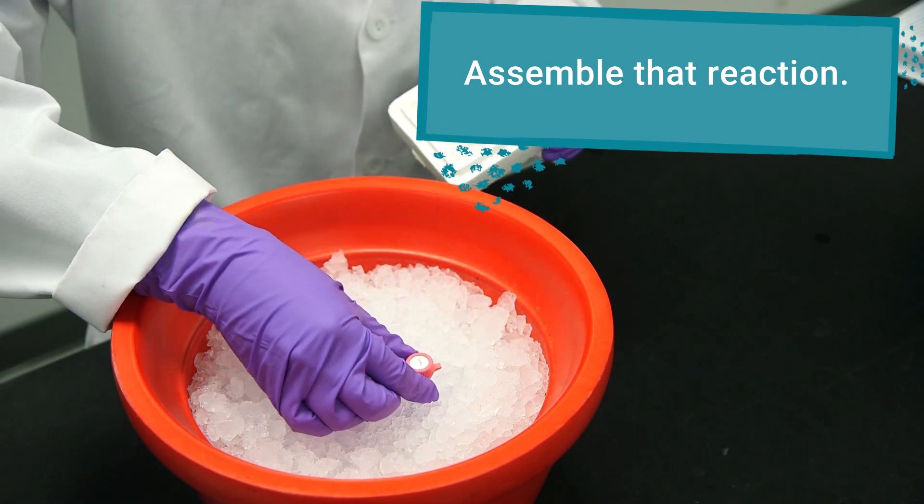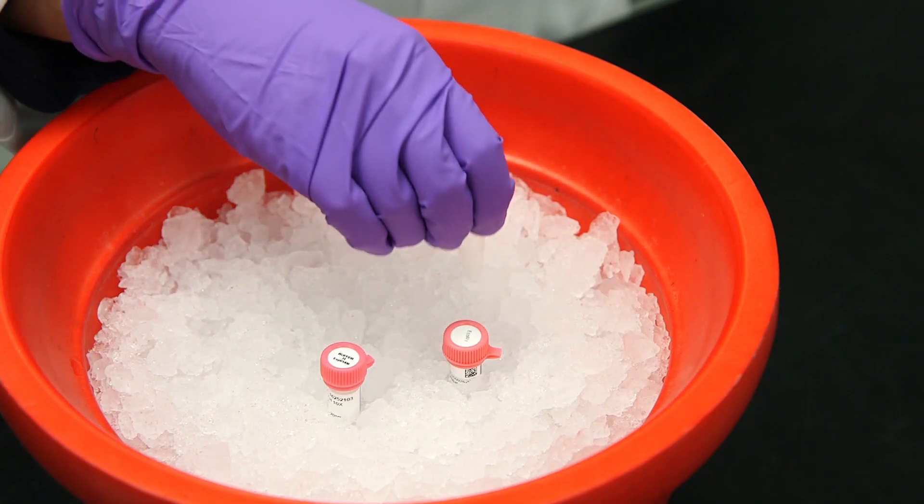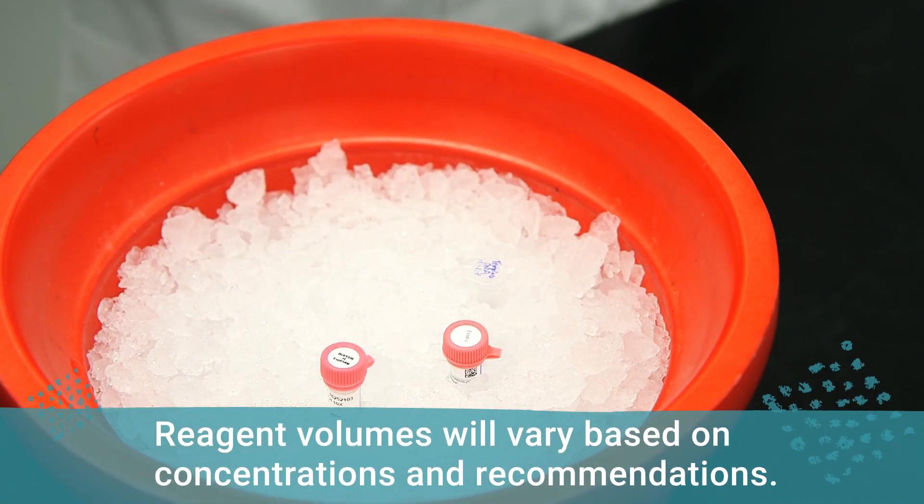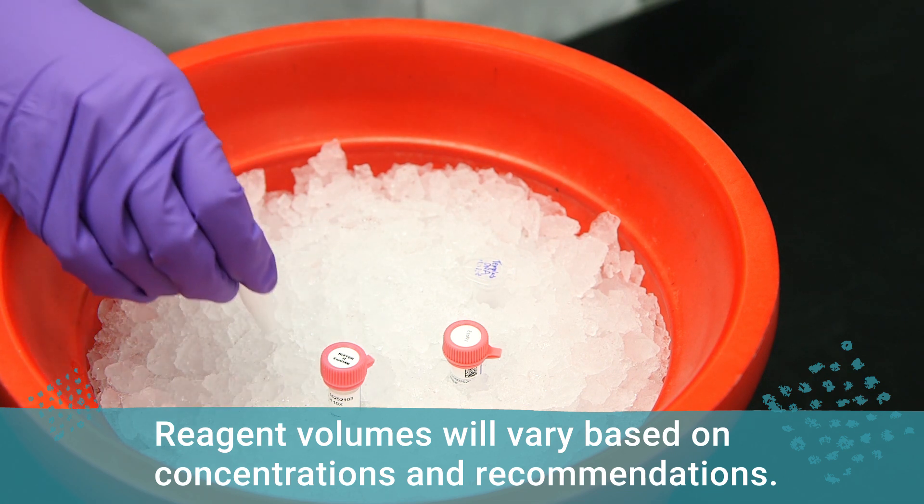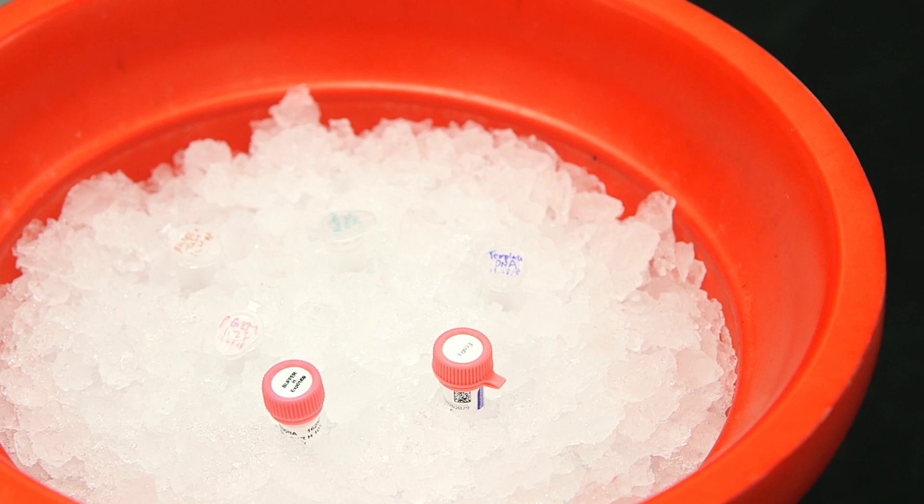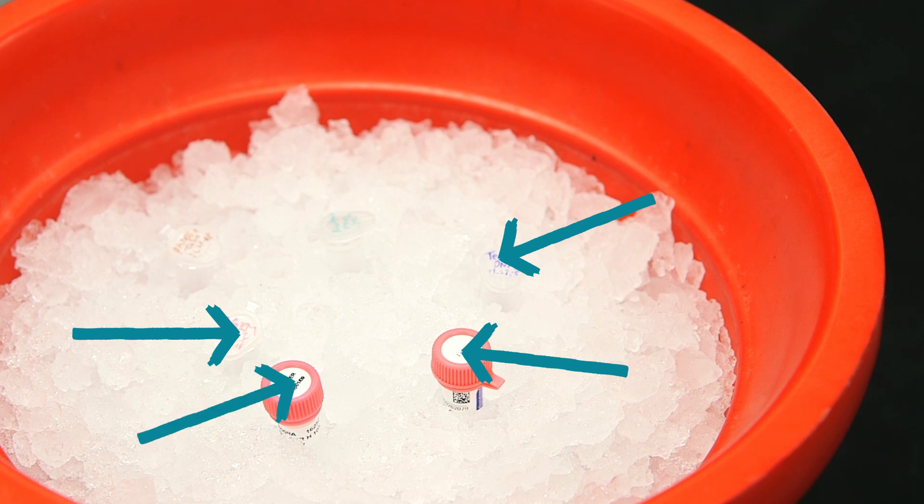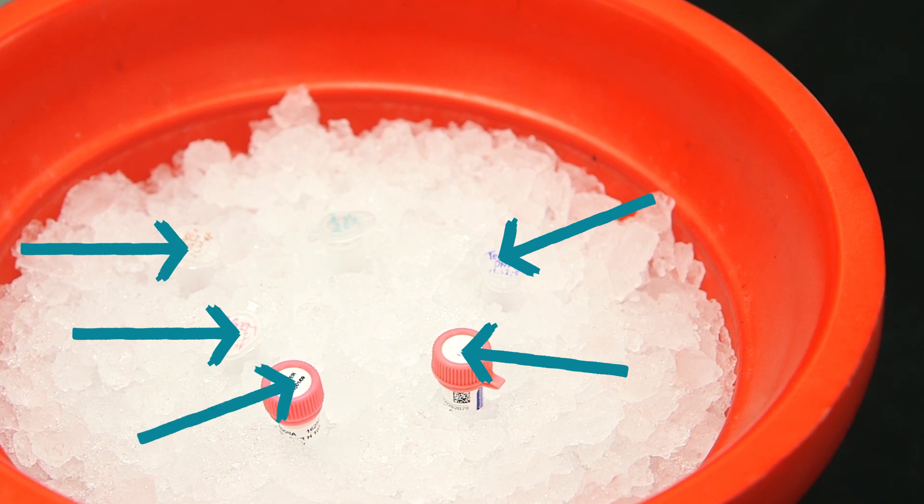Once you have your enzymes picked out, you can assemble your reaction. The exact volumes of each reagent will vary based on concentrations and manufacturer recommendations. But the typical digest contains template DNA, recipient plasmid, your enzyme or pair of enzymes, the buffer recommended by the manufacturer, and nuclease-free water.